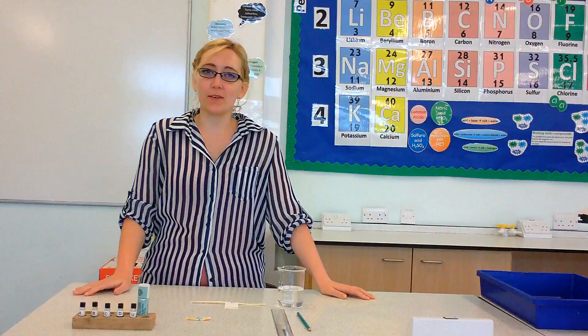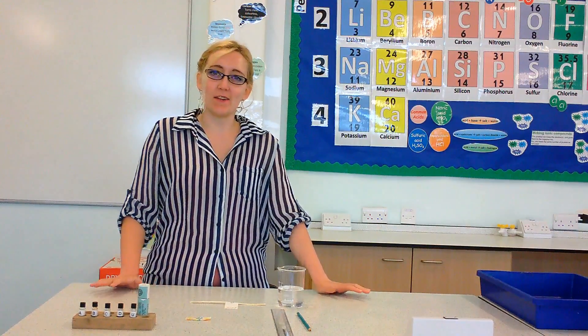Hello everyone. In this video we're going to be learning how to do a chromatography practical.